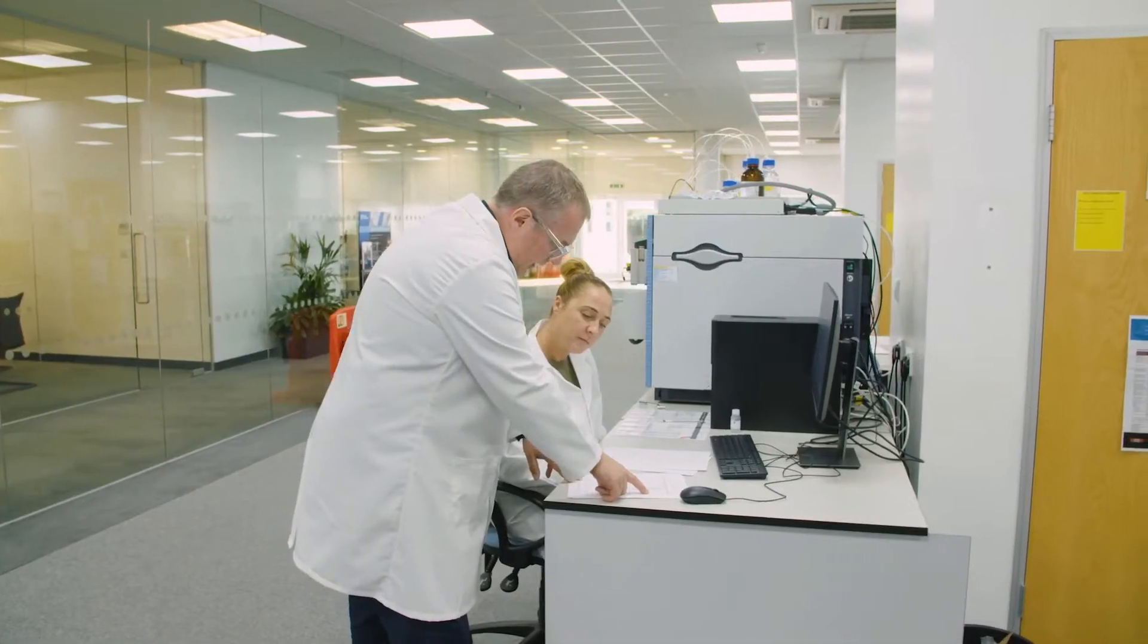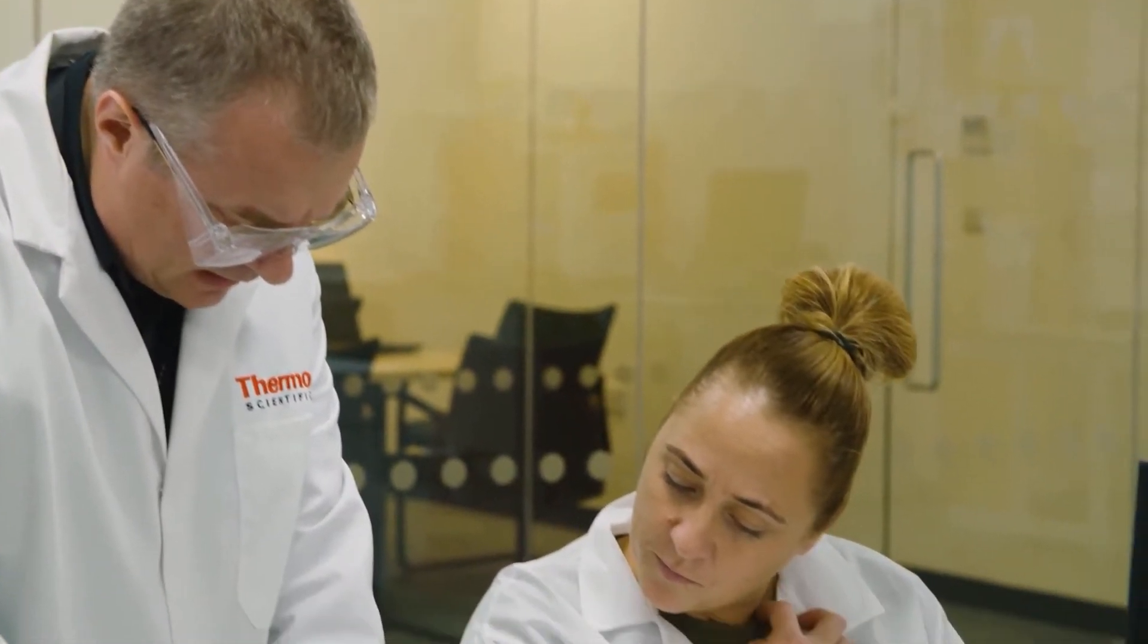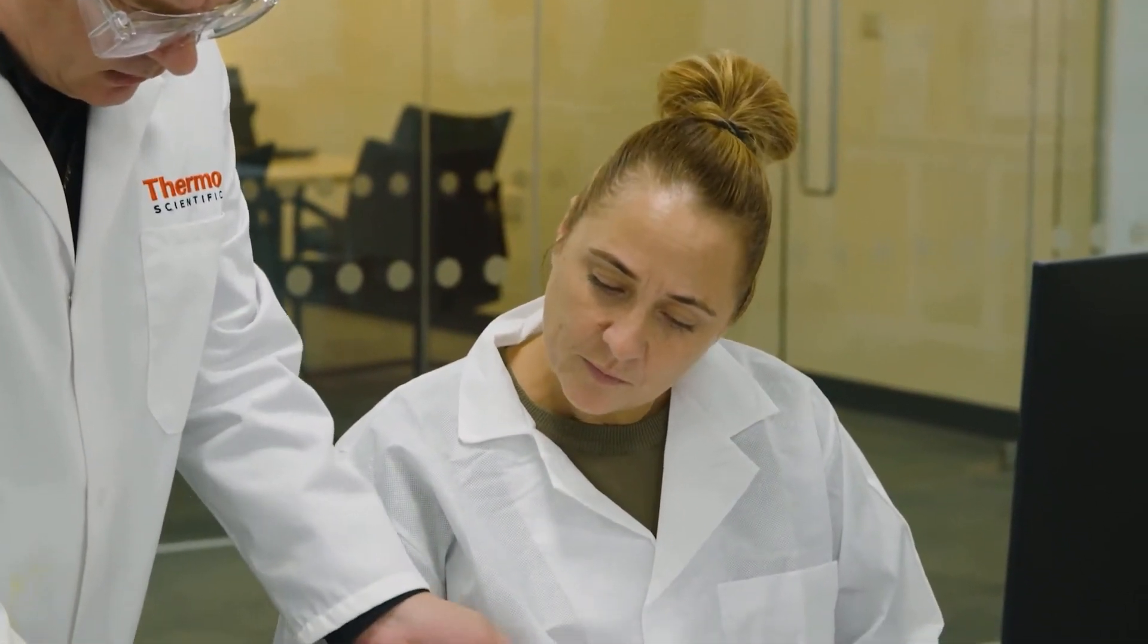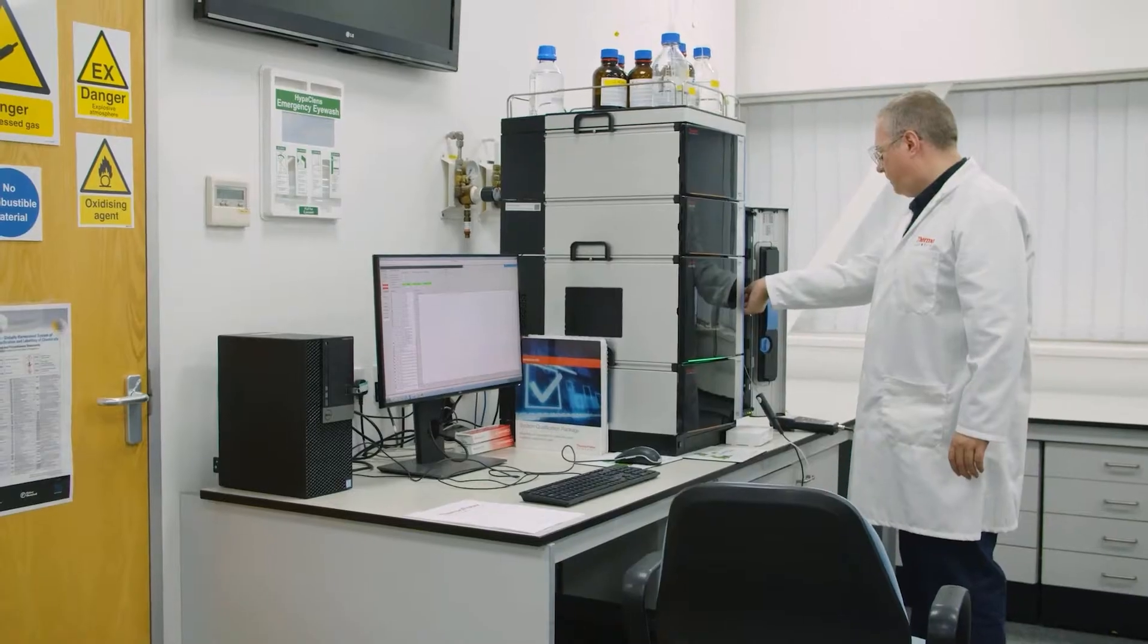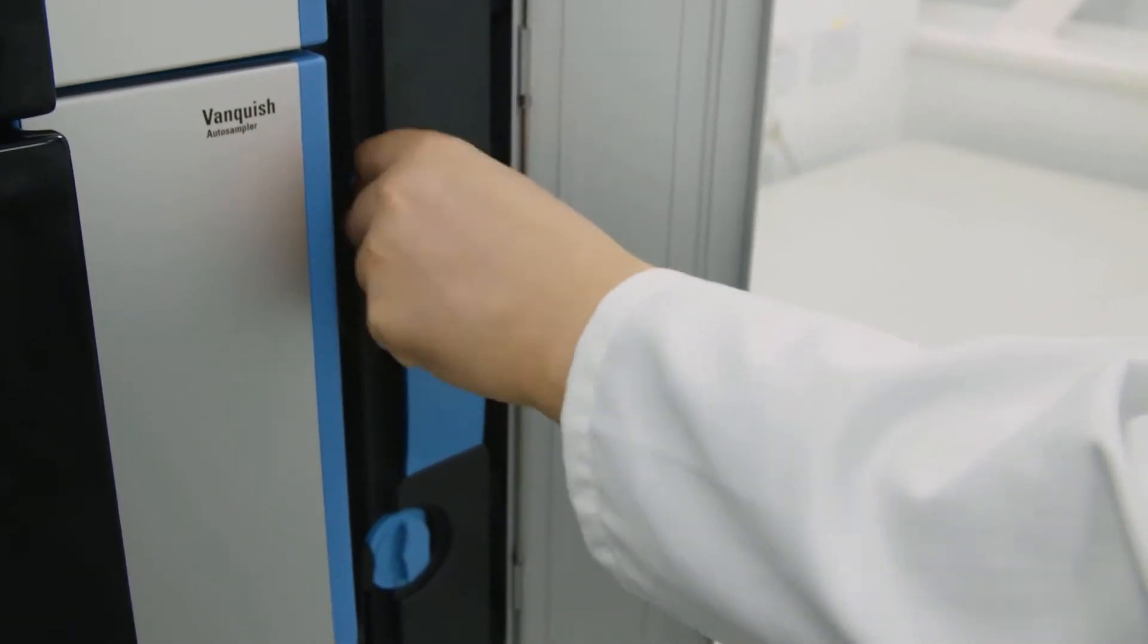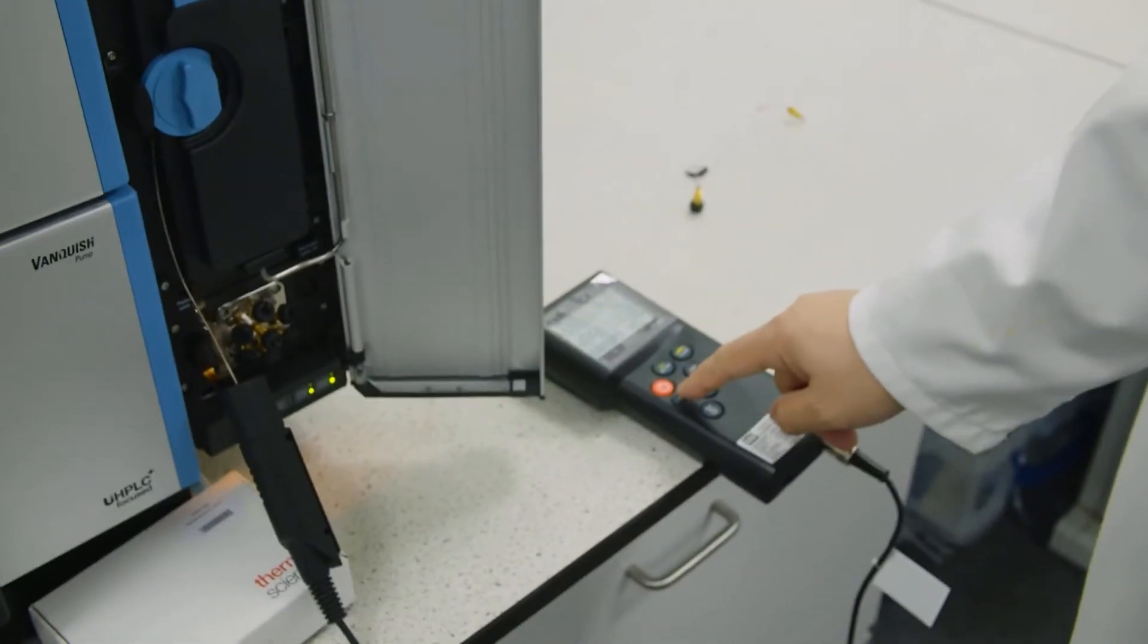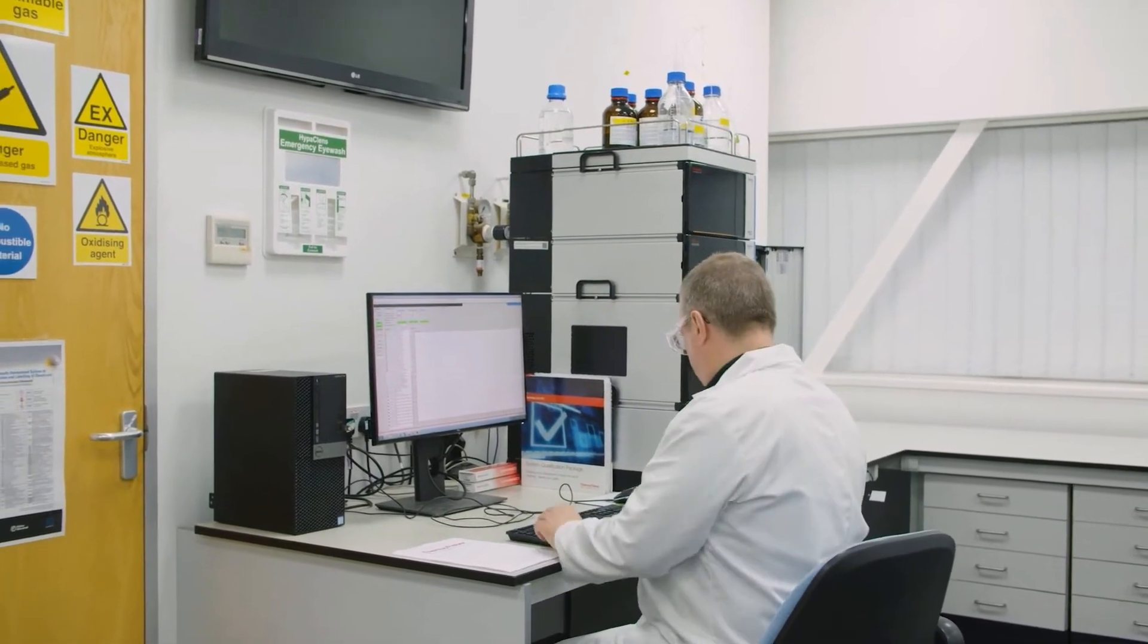Ensuring lab instrumentation is maintained according to operational specifications during an installation and annually thereafter can mitigate non-conformances and support a successful audit. Unity Lab Services, part of Thermo Fisher Scientific, provides proactive service maintenance options for all HPLC systems including installation and operational qualifications.